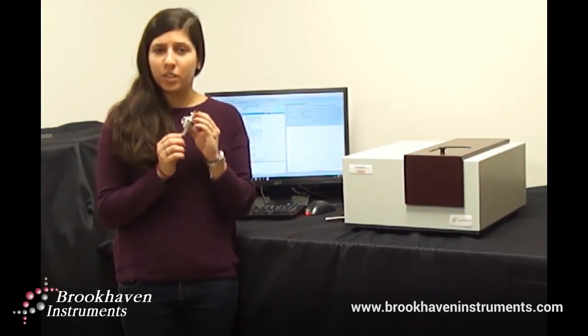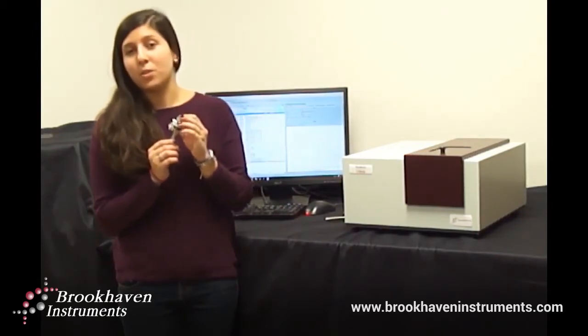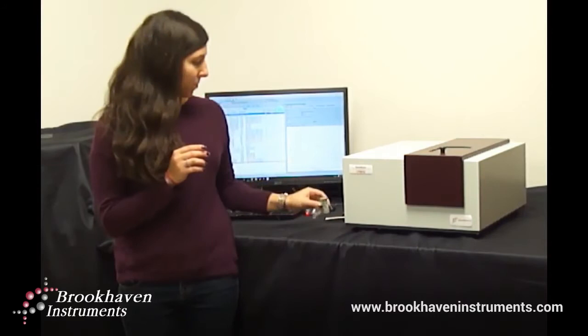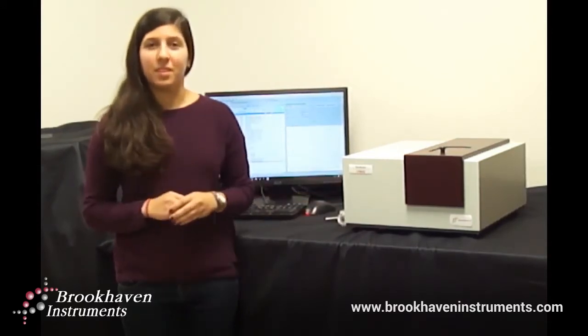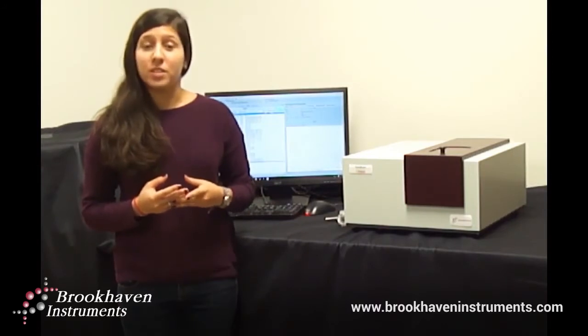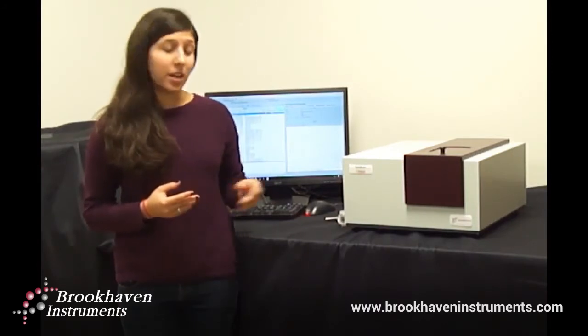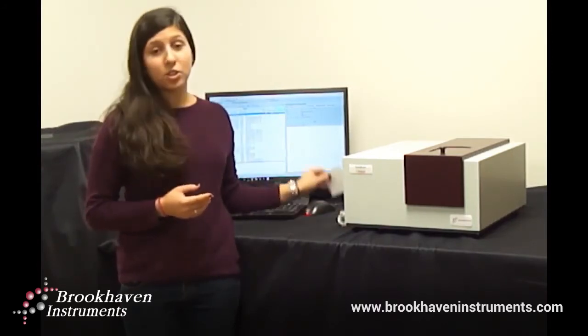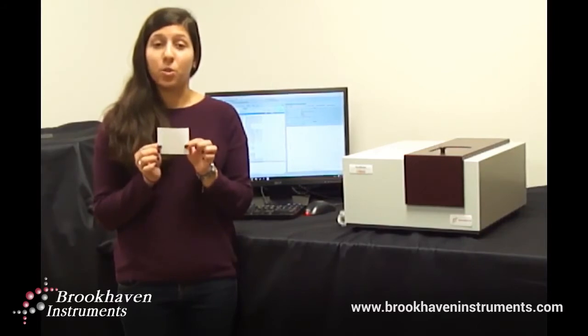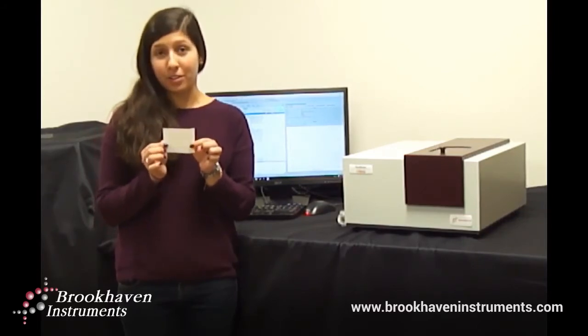Check out our surface zeta potential intro video to learn the basics about the measurement and the electrode. In the first example, we show how to measure surface zeta potential on a positively charged membrane we purchased from a well-known membrane supplier.